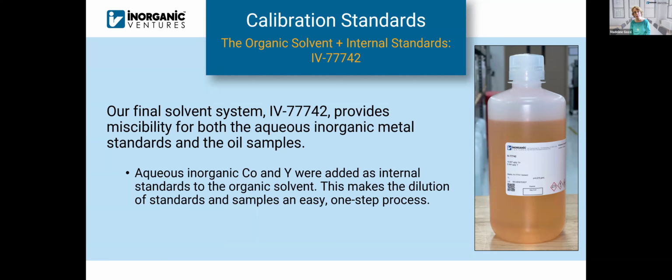Currently, we're doing stability testing on the organic solvent for the cobalt and yttrium components. So far, we have it certified for 6 months stability on the cobalt and yttrium. We are continuing that stability testing out to a year or more so that we can extend that certified stability time. It looks very good for the stability of the cobalt and yttrium in this solvent.